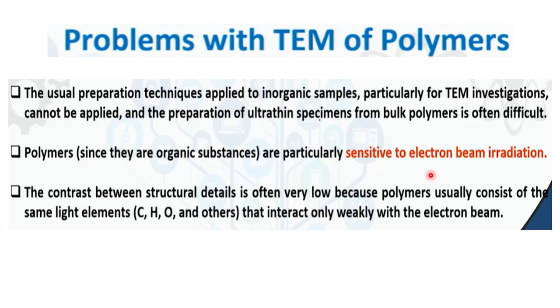So that is the concern. That does not mean that your polymer sample cannot respond or you cannot take images through TEM. Of course, you must go for the TEM, but if you check the contrast or the brightness, the heavier element sample will give you a much brighter image.